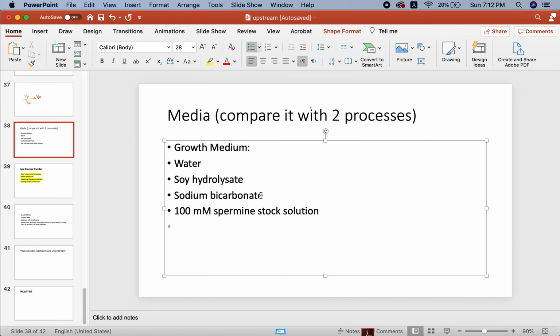Batch N-1 for reagent approach, perfusion working 2000, culture duration 4.0 days, pH 7, PO2, O2 sparge type, drilled pipe, 15 micrometer sintered sparger with adjusted control setting.